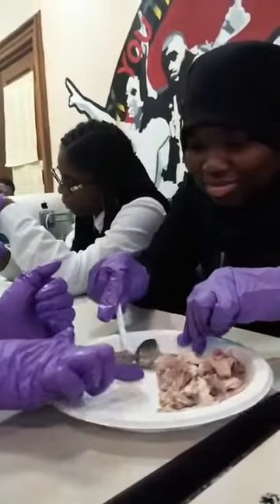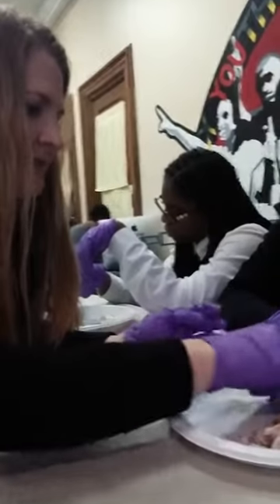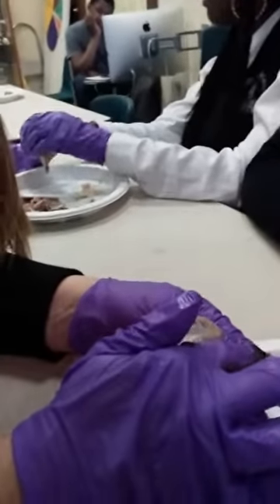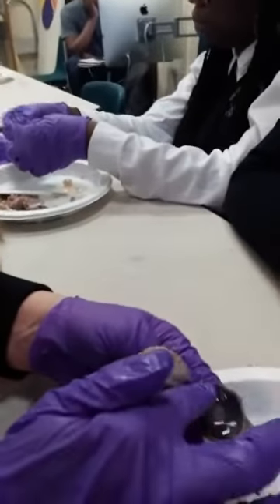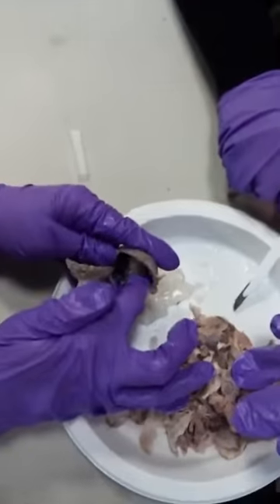See this goo right there? That's called the vitreous humor. All eyes have that in the center of it, and it's also right here. I'm just going to take my finger and gently scrape it out so we can see the features underneath.